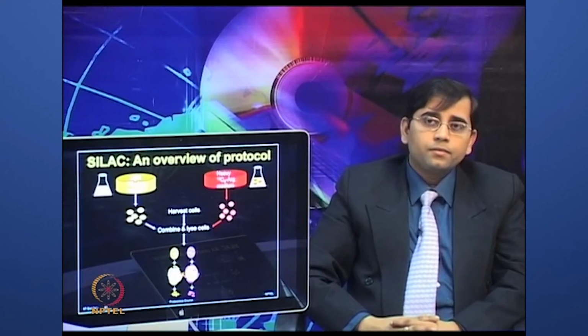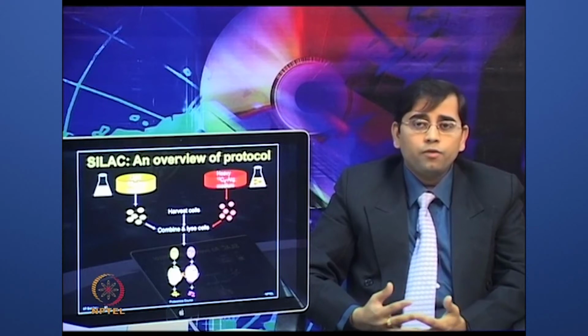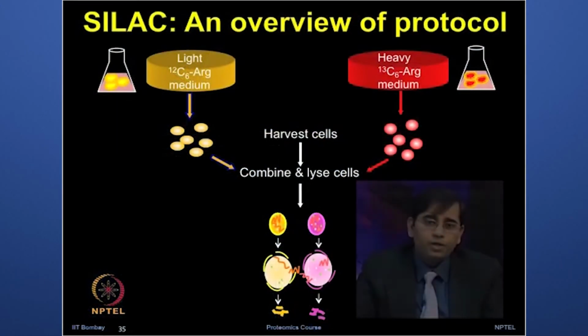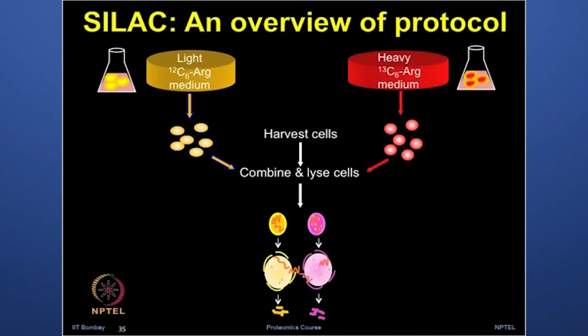So, having discussed the workflow for performing a SILAC experiment, let us have an overview of the protocol. In SILAC, two different cell populations can be grown in DMEM media containing 13C6 stable labeled form of arginine in place of normal or light arginine. After allowing for 5 or 6 doublings, the arginine in each protein is in the heavy form. These cells can be combined and further lysed prior to further proteolytic steps.